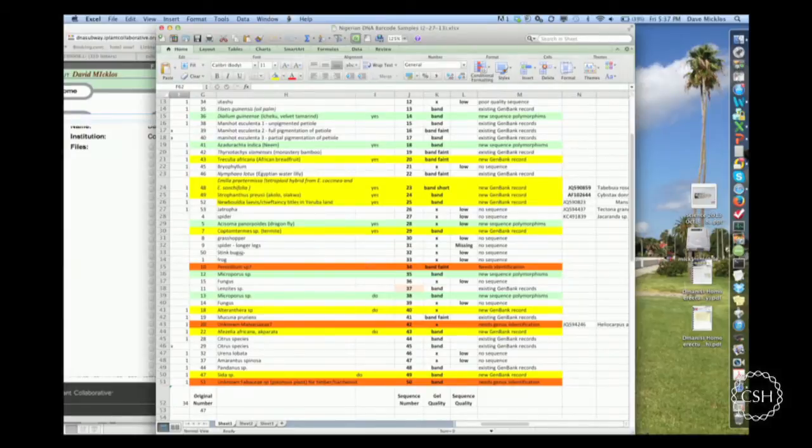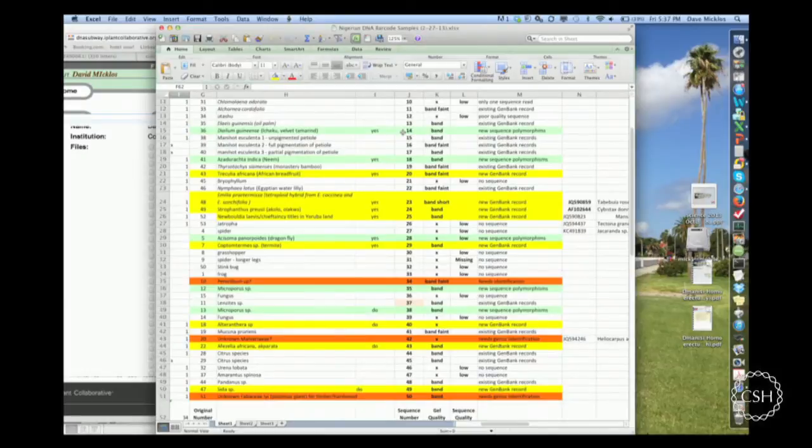So the dragonfly is, I think, 28, yes, okay. So I want to take 28. I want to take the aquaparata, which is 43. And I want to take the boundary tree, which should be number 14. No, sorry, number 25. There it is.